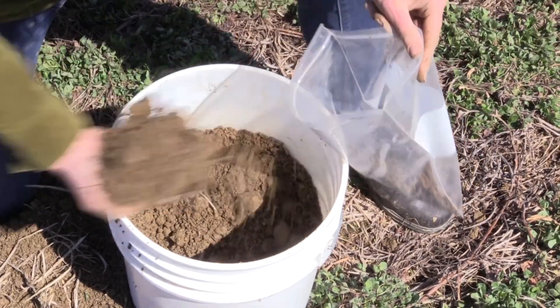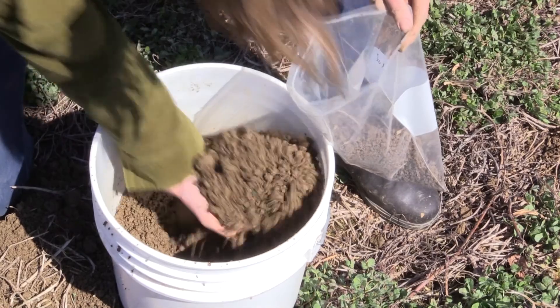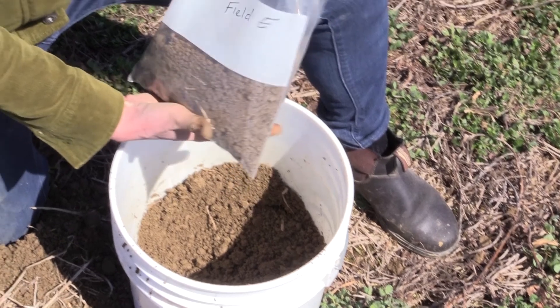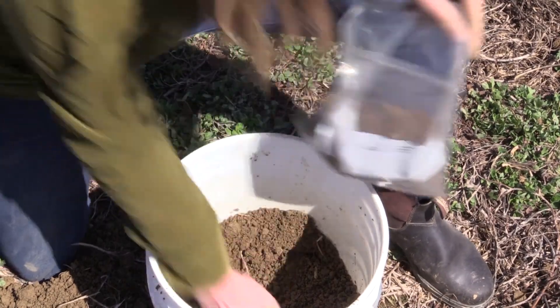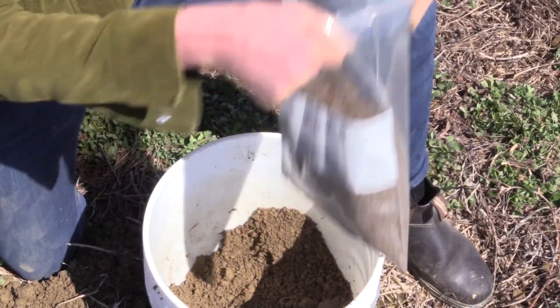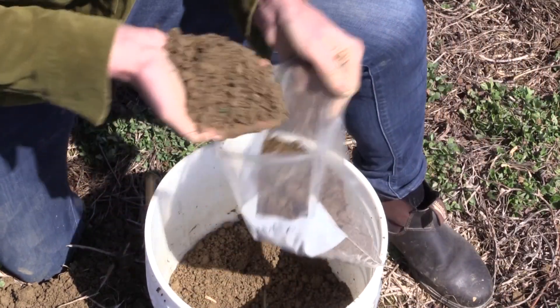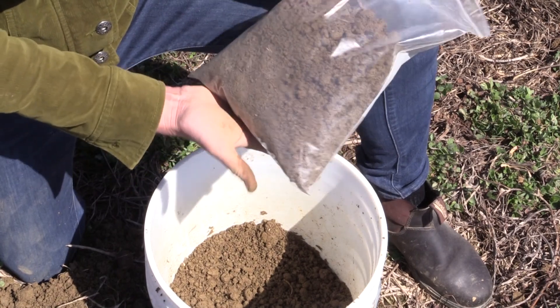The way we typically do it in our research plots is to take a handful at a time, avoiding any debris. I'm looking for about six cups because I'm taking this for the extended package. If taking it for the basic package, that requires three cups. For the standard, I'm looking for about four cups. In this case, we're doing the extended, so we're looking for six cups of soil. That's a little more than six cups right there — that's what we're looking for.